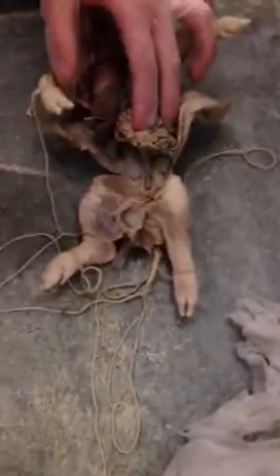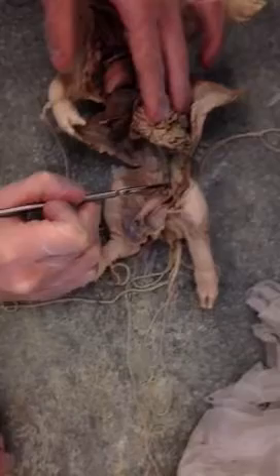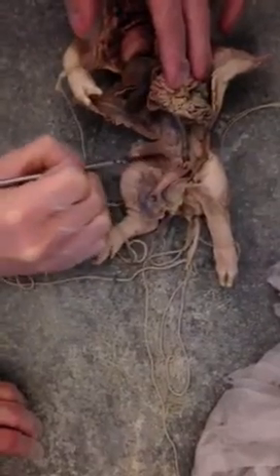Last one is just the reproductive. Okay, now we're going to do the reproductive system. As we said, this fetal pig is a female. So females have ovaries, oviducts, and uterus. So down here, this squiggly stuff, like spaghetti stuff, that's uterus. Right underneath, it's like a little circular mass. That is the ovaries, and right underneath are the oviducts. And there's, again, one on each side.